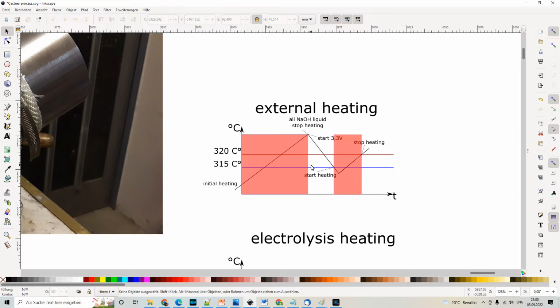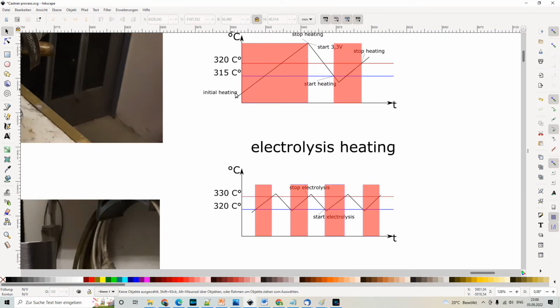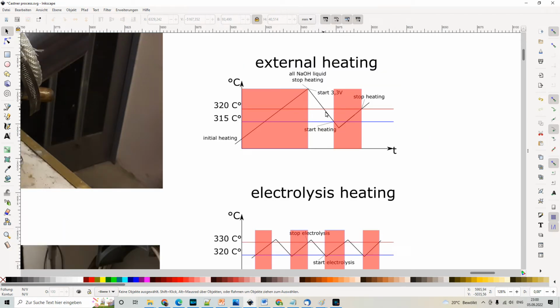And usually the electrolysis is generating also heat. So normally when the system is operating well, theoretically you just need the initial heating to get everything into a melt. And then if everything works well, only the electrolysis heating should work, because the electrolysis heating should put enough energy, enough heat into the system to keep everything molten. If that's not the case, then it's still good to have this other temperature regulation here. So if the temperature should drop beyond 315, it should start to heat it up again to 320.